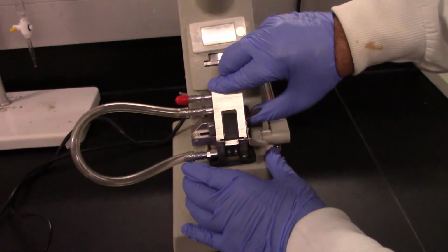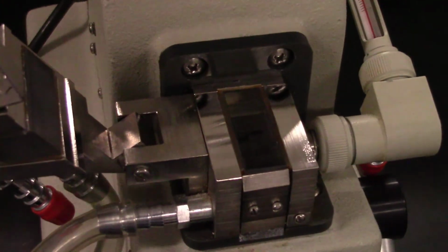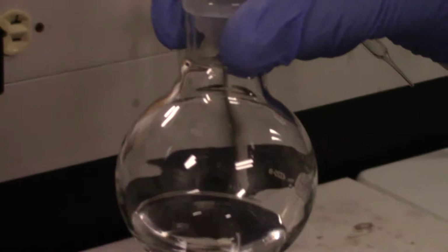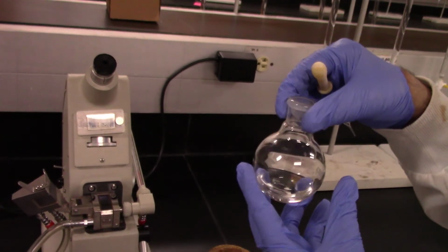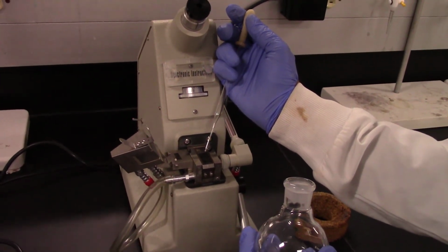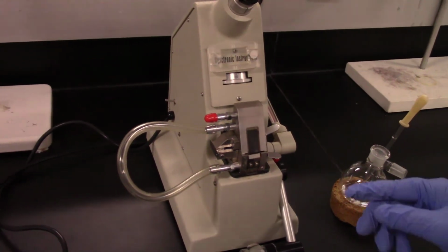And these are two prisms that are sitting on top of each other. What you want to do is you put a couple of drops on the lower prism, the drops of the liquid that you want to measure the refractive index for. This is basically the unknown liquid leftover in the pot when we stopped the distillation. We put a couple of drops on top of the lower prism, and close the upper prism on top of it. Make sure it clicks closed.